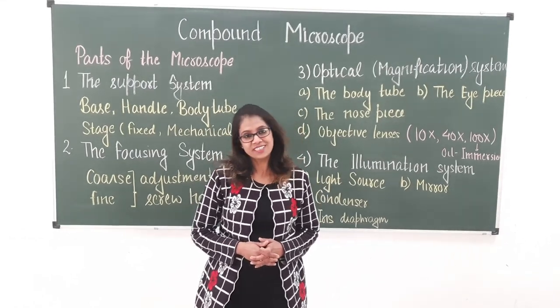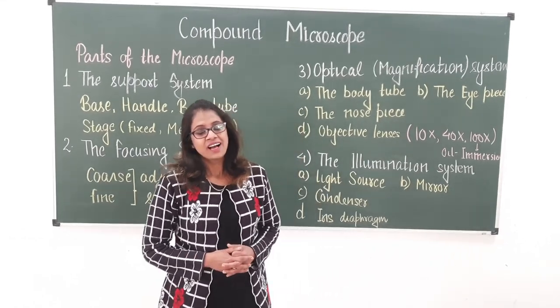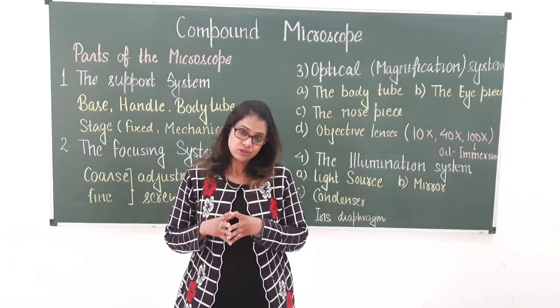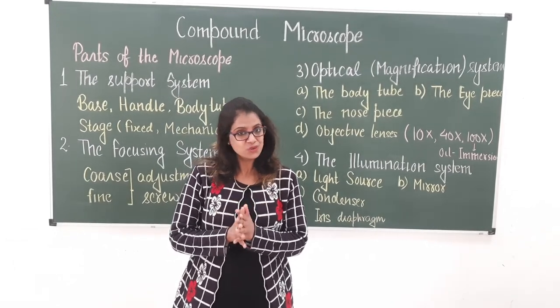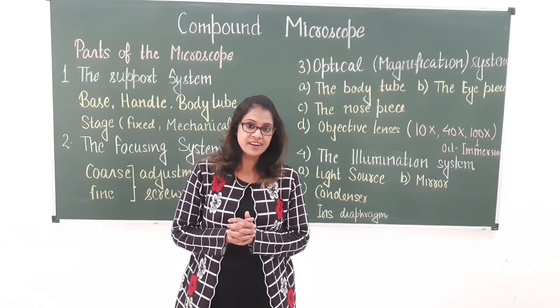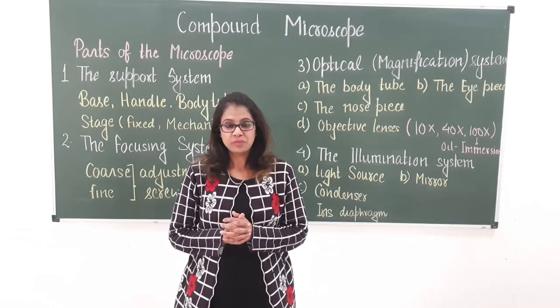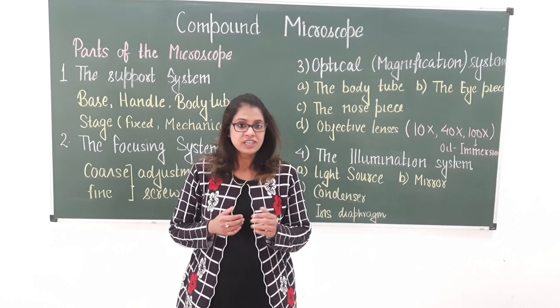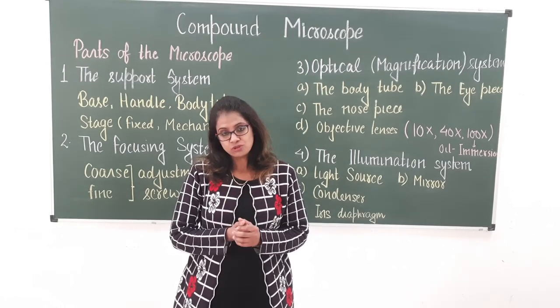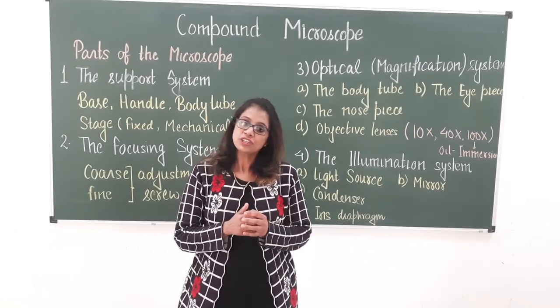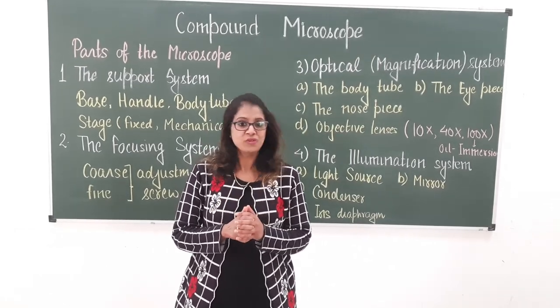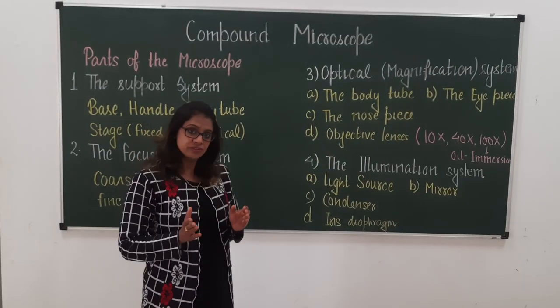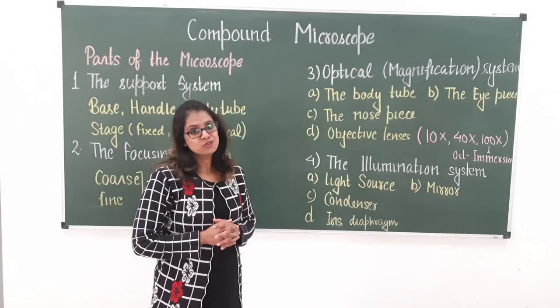Hello everyone, this is Dr. Geeta Samnani. Today I'll show you a compound microscope, which is a very important instrument in the hematology lab in first year and in pathology exams as well. We must know each and every part of the compound microscope and how it functions.